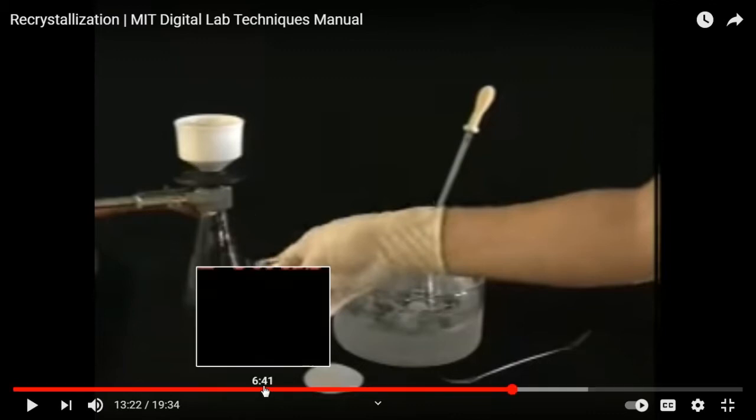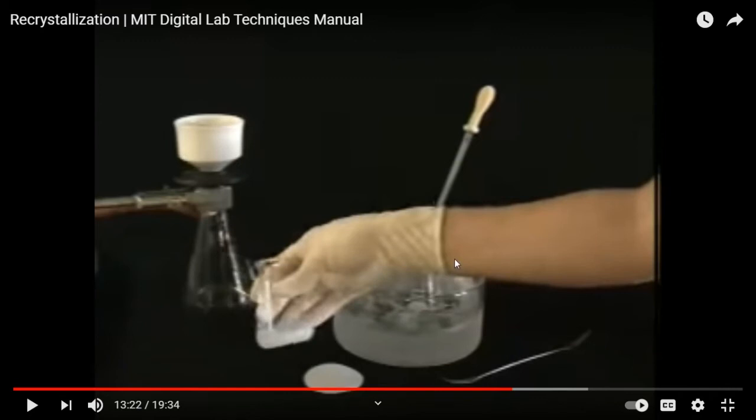Let all the liquid go and then you add fresh cold liquid again so it doesn't dissolve away your compound at the low temperature. Every single action you do scientifically, there is a reason planned out. Okay, you need to understand those things. Focus on those justifications, the principles behind each and every step of the experiment.